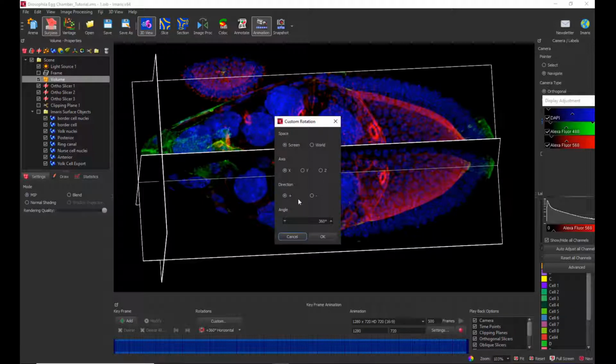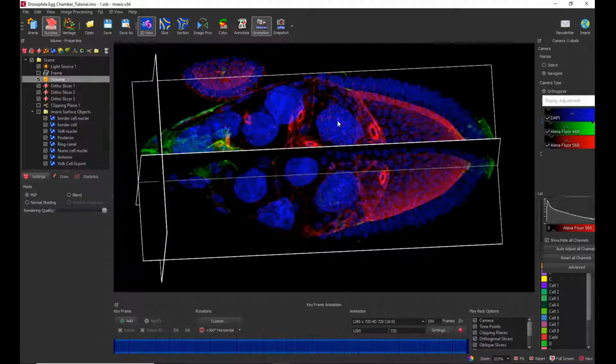So customization looks like this. Just define all the rotation parameters. Then there is a section about animation output. You need to pick your output according to your needs. You can see, first of all, that the aspect ratio of the outputs differ, and the resolution also differs for the output. So here it's important that you fit the output to your needs.